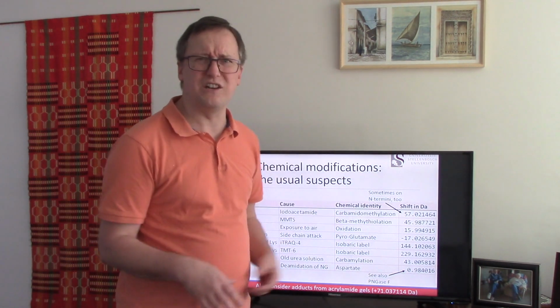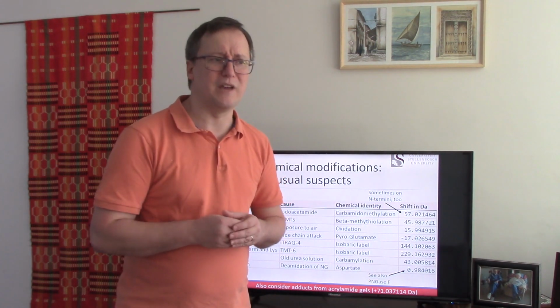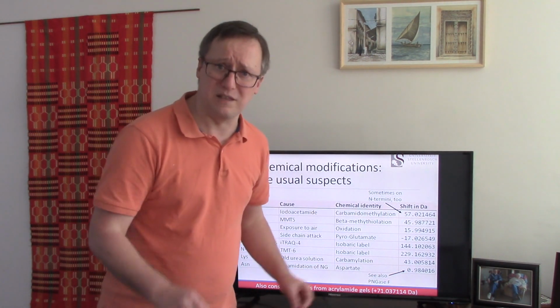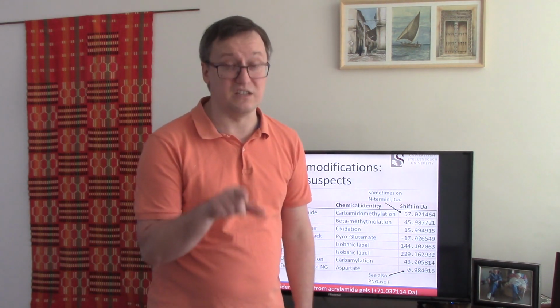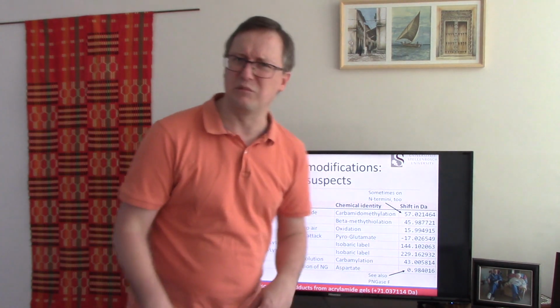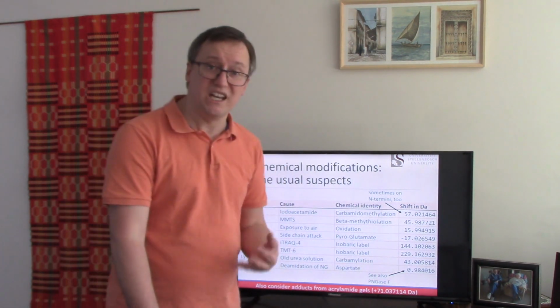There are another two reagents that came up in our Twitter discussion of how to make this slide. Iodoacetic acid is probably the most common one after these two, but there are lots of ways that people mess with cysteines. And cysteine, I got to tell you, is shifty. If you're just looking at it out of the corner of your eye, you might notice it's changing its chemistry and getting formylated or something bizarre like that. So cysteine's tricky.